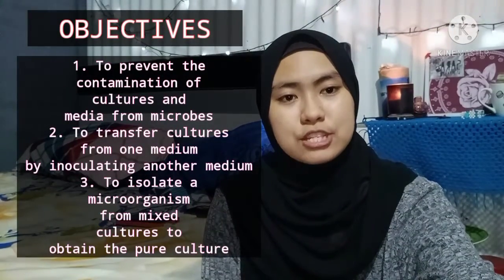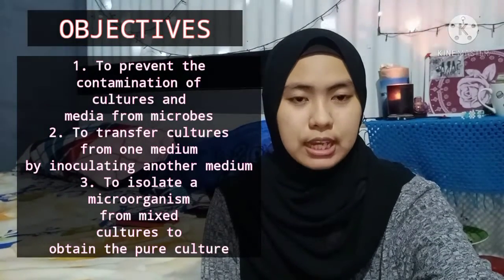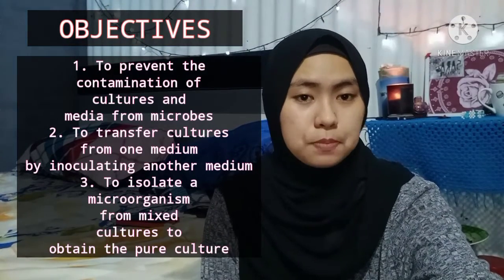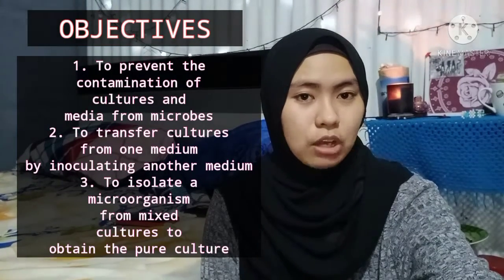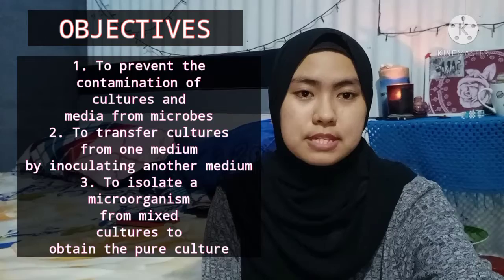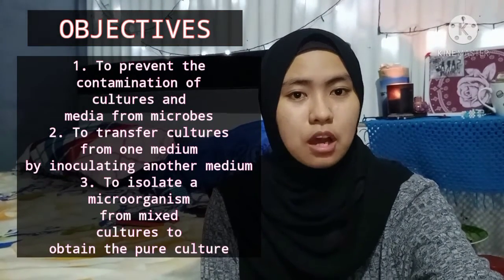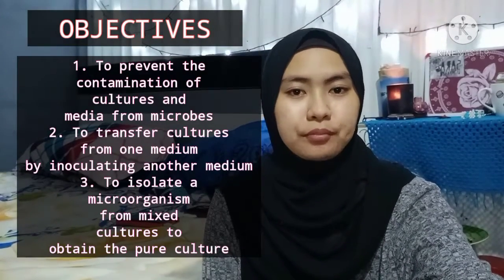These are the objectives of the aseptic technique. First is to acquire the skill of aseptic technique in the field of microbiology. Second is to prevent contamination of cultures and media from microbes in the environment. Third is to transfer cultures from one medium by inoculating another medium. Fourth is to isolate a microorganism from a mixed culture to obtain a pure culture. Lastly is to prevent lab microorganisms from being spread in the environment and infecting the investigator.